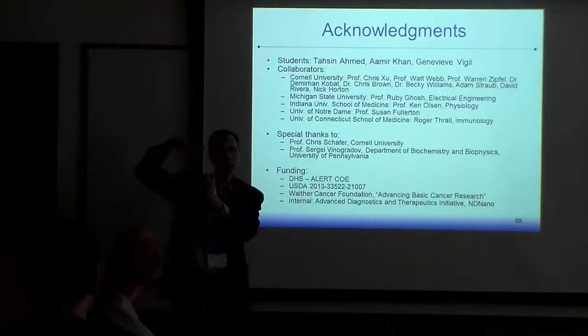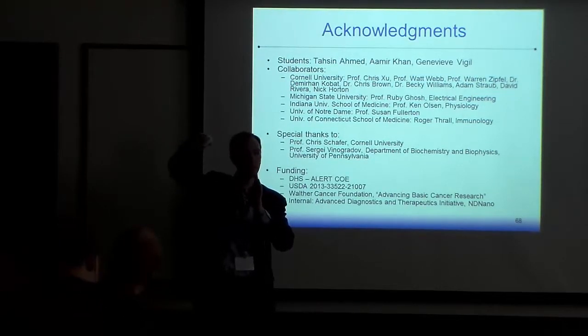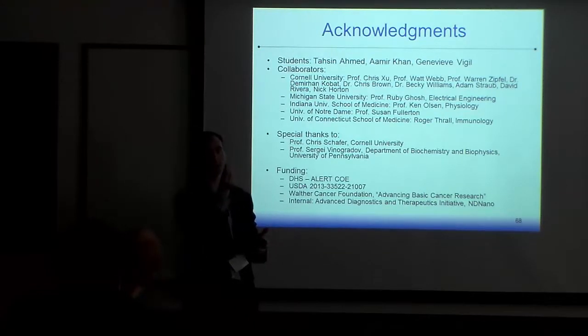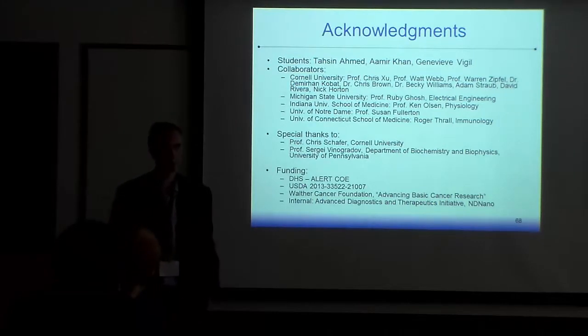We don't even descan it. We have a big single area detector. So no matter what path the photon takes to get back to my detector, we know it came from this point that was created by ballistic photons. So it's basically like confocal microscopy for free. You don't need a pinhole, because the ballistic photons create a case where excitation only comes from a localized volume. So it's a great question. Thank you.